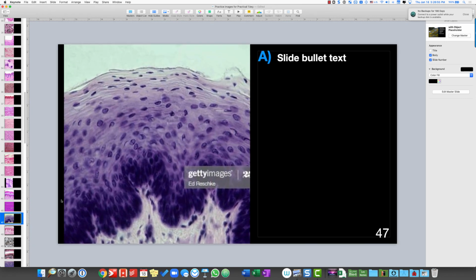Okay, now this is non-keratinized stratified squamous epithelium. Okay, this is the stuff you find in your esophagus, anus, the genitalia, your penis, and vagina. Those are all lined. The wet mucosa. Okay.